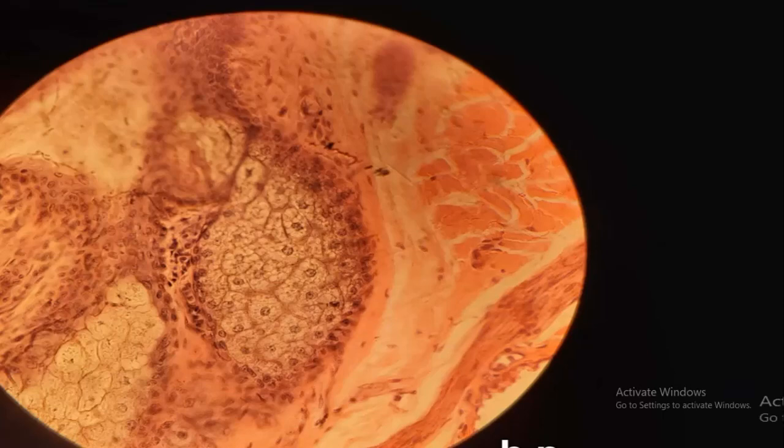In your case, it can be practical number 1, but that's what is supposed to be known. View that, screenshot, and examine yourself: see the nucleus, the nuclear membrane, the sebaceous gland, the erector pili muscles. View all those things and know them by heart, because you'll be examined on that.